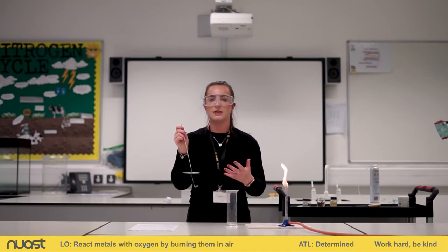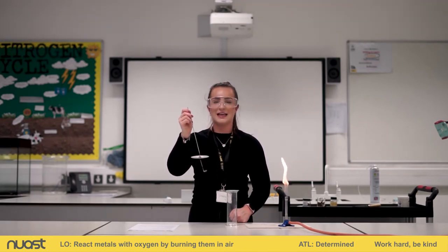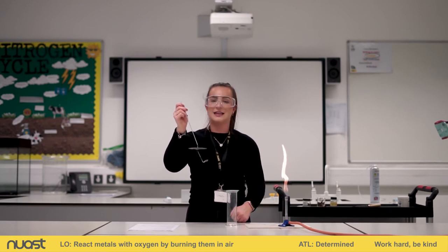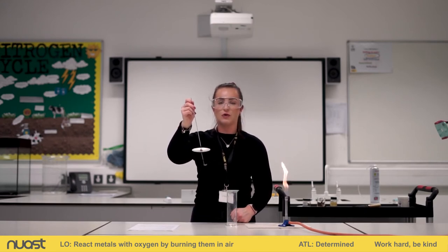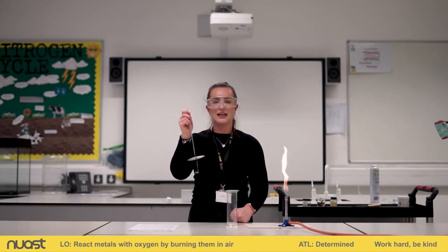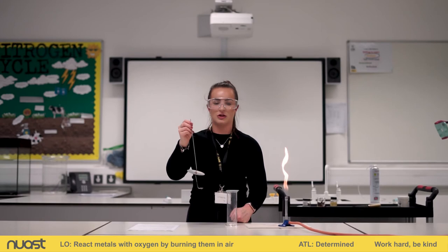So remember, when something reacts with oxygen, it's called an oxidation reaction. And calcium's that reactive with oxygen, I think it's actually already reacted with the presence of oxygen in the air, and that it didn't need the Bunsen burner, it's already reacted and got that calcium oxide layer. Okay, and it's quite difficult to get through that calcium oxide layer once it's been formed. So unfortunately that one's not worked, but we can still write in our results table what we would have seen if it had worked and that calcium oxide layer hadn't been formed prior to the reaction.